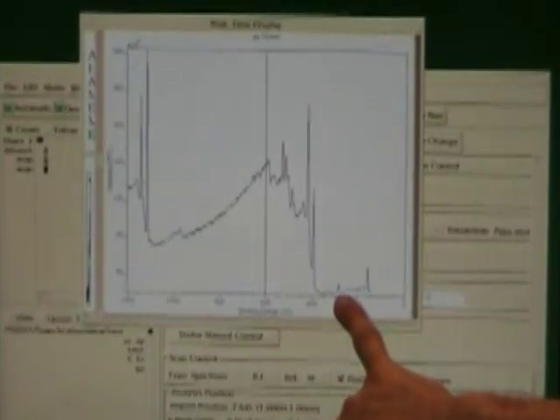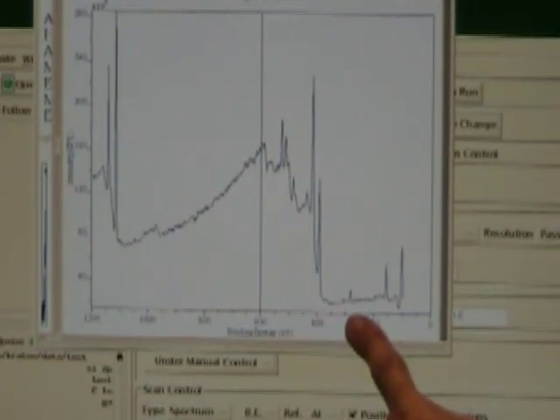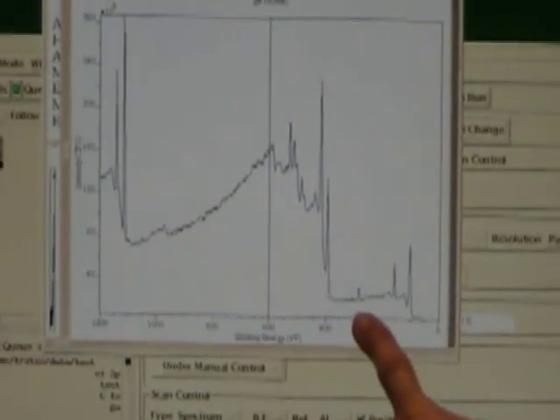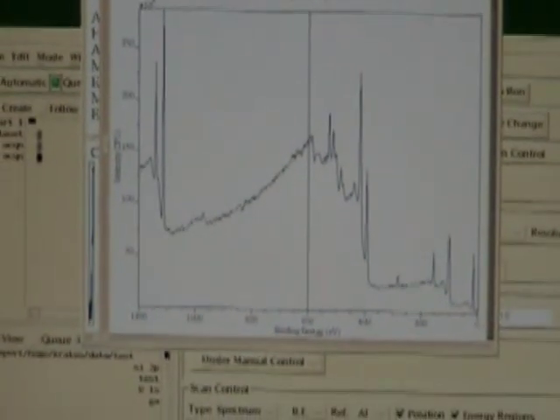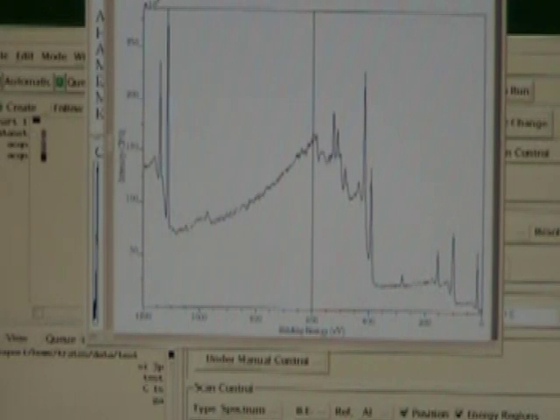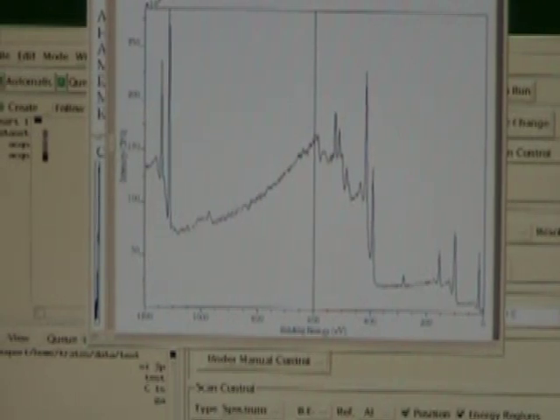There's an oxygen peak here. We'll be zooming in on these later and identifying them. A little bit of carbon on the top, the very topmost surface of the sample, which is typical for something that has been out of the vacuum chamber. And a few more gallium peaks.